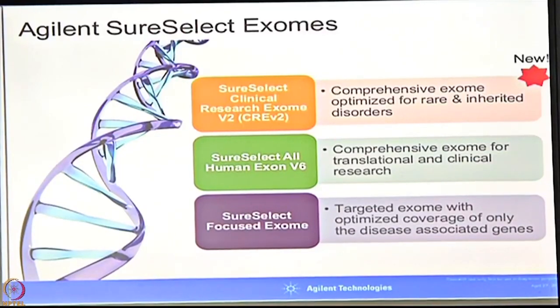Another, we have a very small panel, the focus exome, which covers the disease-associated regions. But most of the rare diseases I talked about before are studied with the clinical research panel.